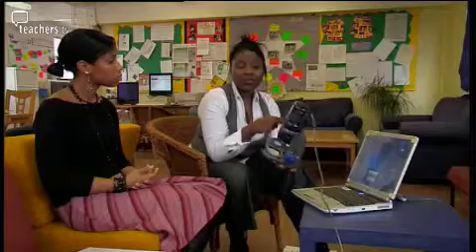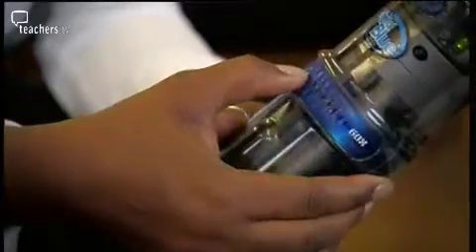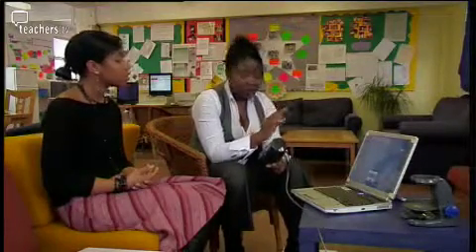One of the things that you might want to go through at the beginning of the lesson is talking to the children about the microscope and the parts of the microscope, particularly looking at the magnification, 60 times, 200 times, and so on. But also on the software, what's really nice is that you can actually take time-lapse photography with the software. So I could do it throughout the whole day? You could do it throughout the whole day. Wonderful. Or 24 hours or 48 hours. Excellent. You know, whatever you choose.